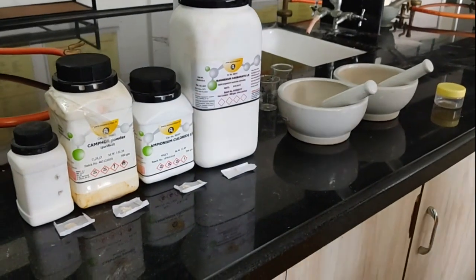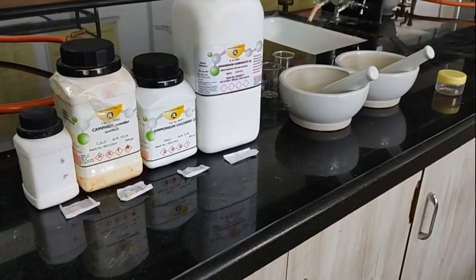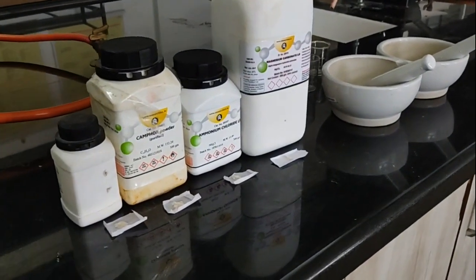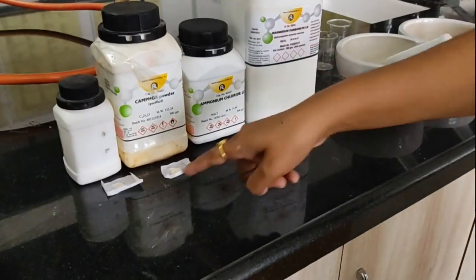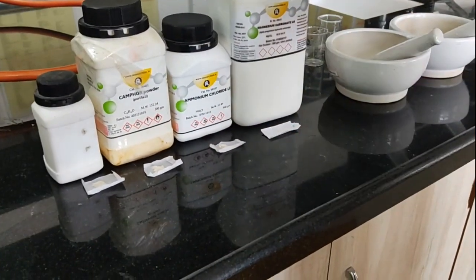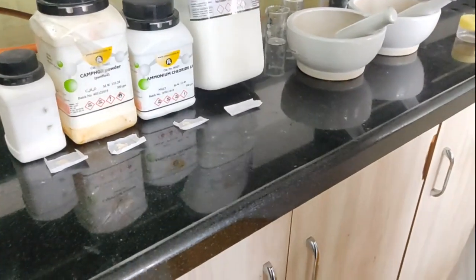So we have, first of all, these ingredients which are previously weighed. This is menthol, which is previously weighed. Then this is camphor, this is ammonium chloride, and this is the magnesium carbonate.